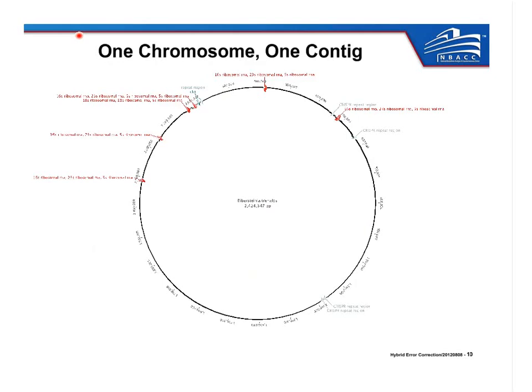So this figure just shows the annotated contig that we produced from the assembly. And again, I'll emphasize that this was a push-button automated process. So we ran the correction. We took the longest 6,000 base plus reads, and we ran the Celera assembler, and we got an automated result out. So this just shows some of the annotated repeats along the assembled contig.